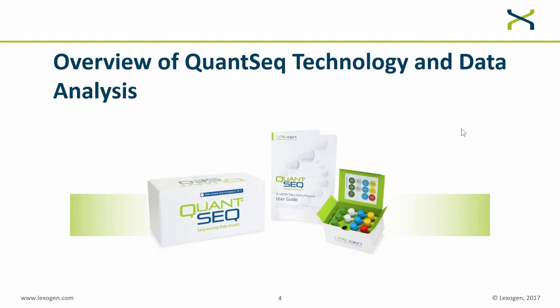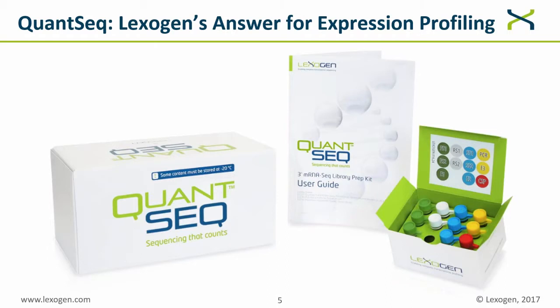Tonight I'll be talking about the QuantSeq 3' mRNA-Seq library prep kit technology and data analysis. Some of you may be familiar with QuantSeq, but I'd like to start with an overview of the QuantSeq technology and protocol. So the QuantSeq 3' mRNA-Seq library prep kit is specifically designed for expression profiling RNA-Seq projects.